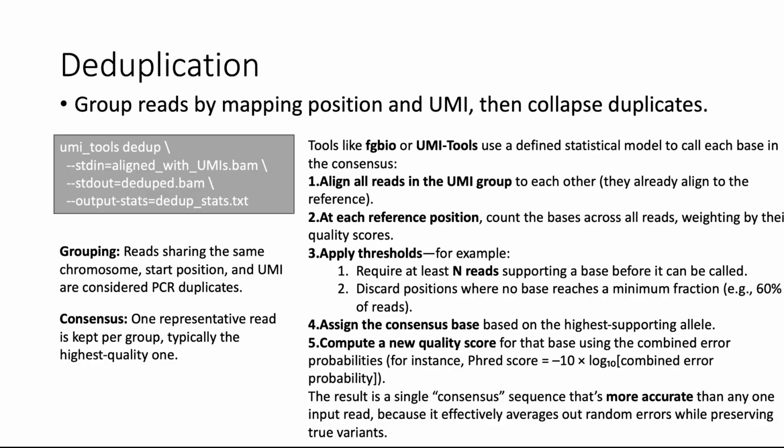Applying different thresholds, we will be able to select a minimal level of certainty that these reads were made correctly, and to result in a consensus file with deduplicated information from initial reads.